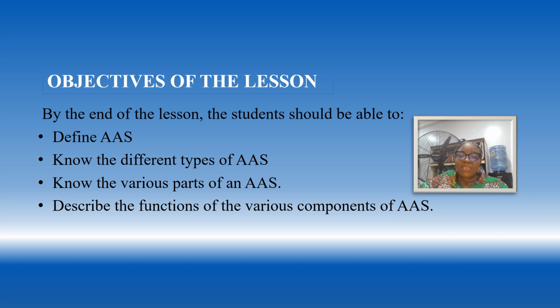The objective of this lesson: by the end of this lesson, the student should be able to define AAS, know the different types of AAS, know the various parts of an AAS, and describe the functions of the various components of AAS.